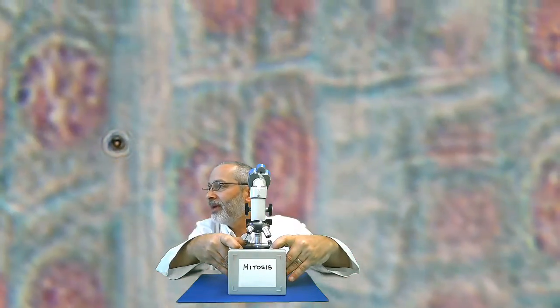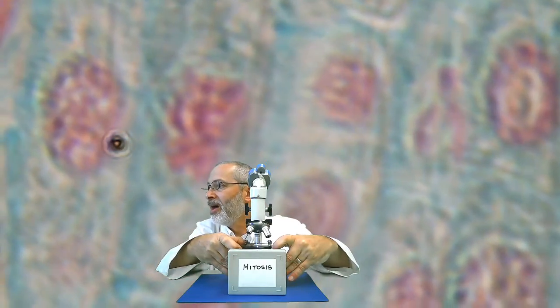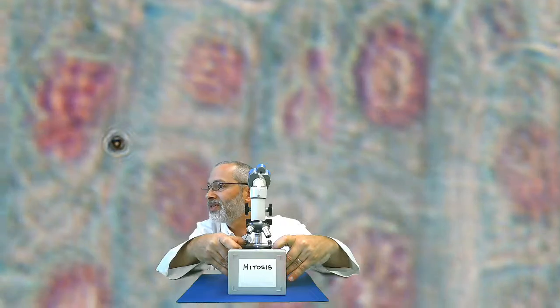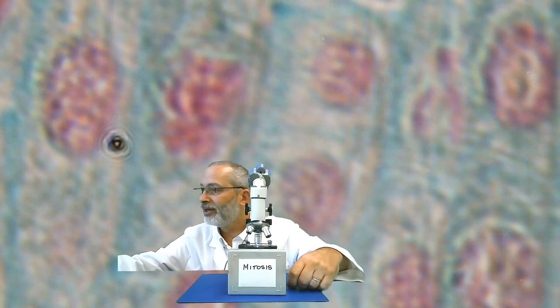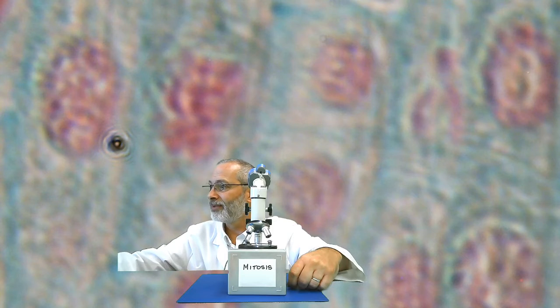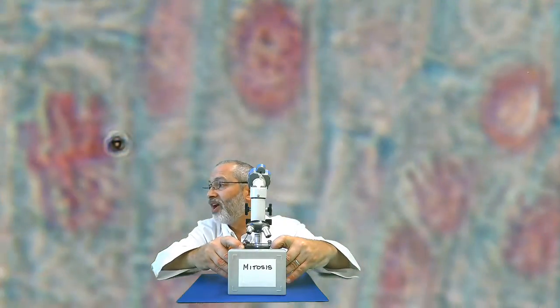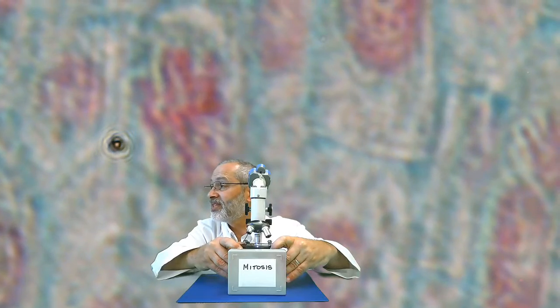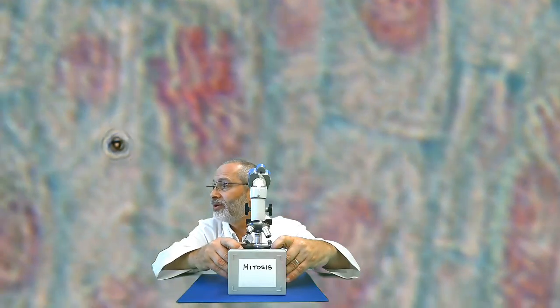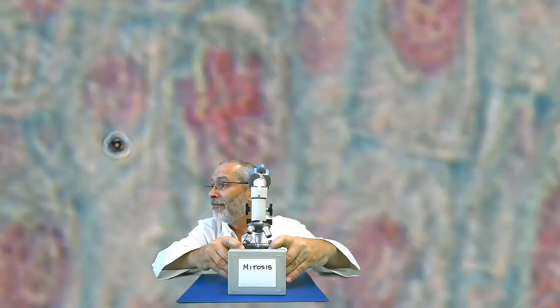Part of this activity involves spending time hunting around, simply looking for appropriate specimens under magnification in order to find cells at different stages of cellular division or nuclear division that we call mitosis.